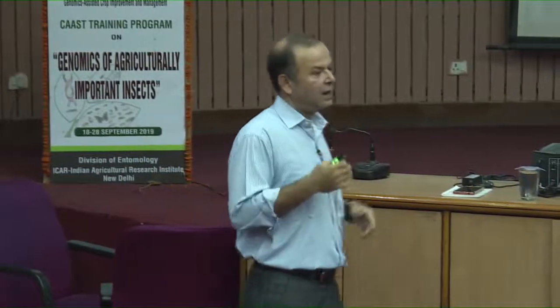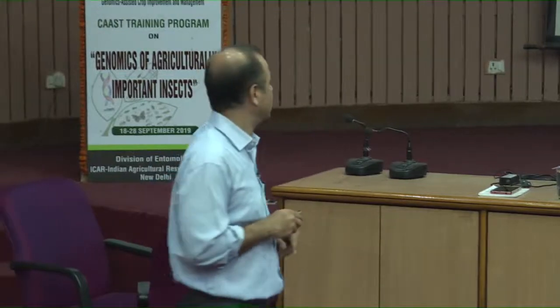Again in simpler terms, suppose your housekeeping gene has shown two-fold difference. Okay? Means in one case it is say 1x, another it has gone to 2x. A two-fold change has occurred and you have considered that that two-fold difference is because of all these unwanted things. And now if your sample shows 8-fold difference, you will subtract two-fold. You will say, 2 out of 8-fold is because of unwanted things, so 6-fold I accept. So, this is normalization. In a simple way, this is normalization, but again there are mathematical formulas to do that. Okay? Mathematical formulas to do that.